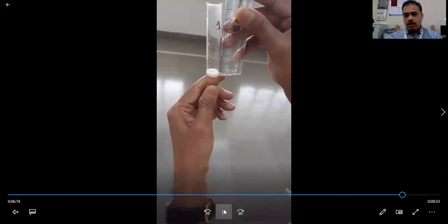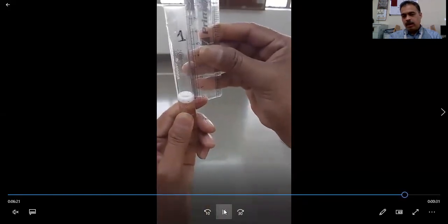And after some time, measure the length. So this is the determination of foaming index, and a total of 10 test tubes are written. In front of that, we have to write in centimeters how much foam has been produced.